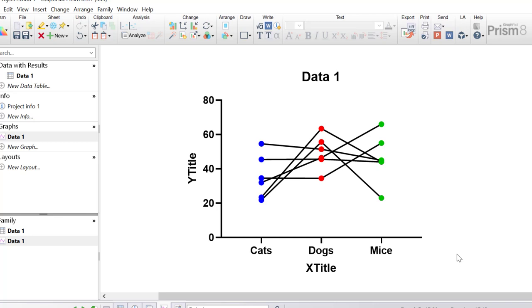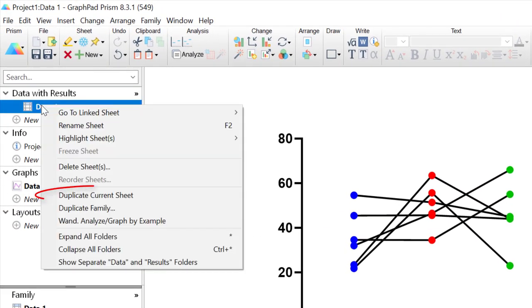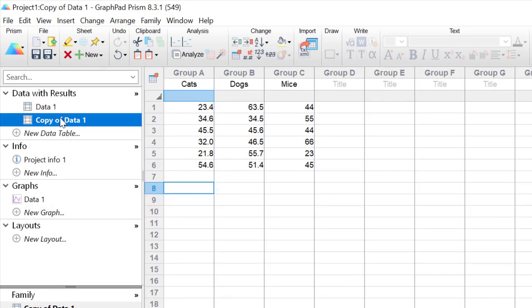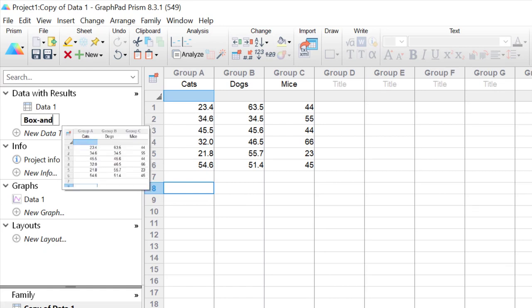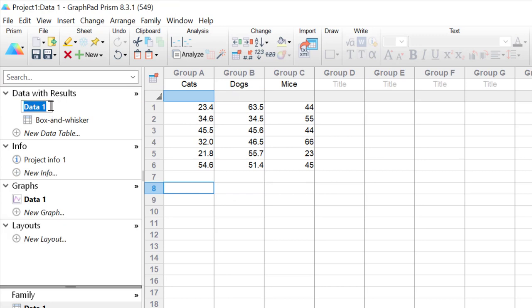Now I need to prepare this graph so it can be overlaid with the box and whisker plot. I want to delete the axis titles and the graph title so it is ready to be overlaid. The next thing is to create the box and whisker plot using the same data set. I'll right-click on the data set and click duplicate current sheet, then relabel it as 'box and whisker' and rename the original as 'before and after'.